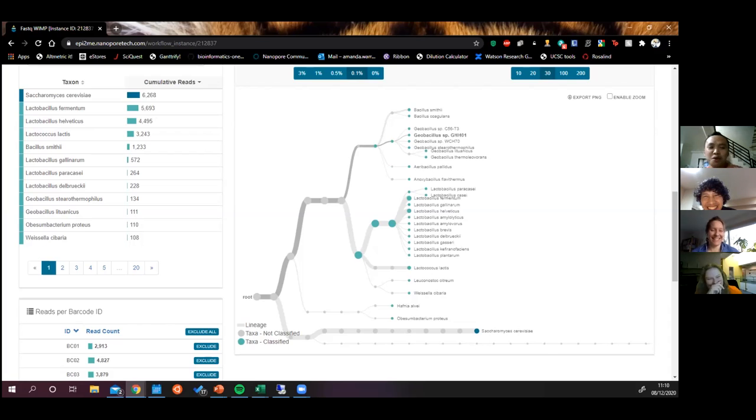Exactly. So if we're going to make our own database, for instance, of just unique species, including endemics, that are present in our sampling area, would you recommend we include the whole genome, or are specific barcode regions sufficient?